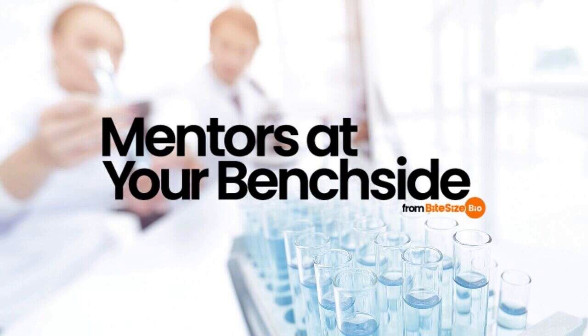The photomultiplier tube. These highly sensitive detectors collect photons emitted by your sample. They basically transform the light signal into an electrical one that's recorded by a computer. And in doing so, they multiply the current produced by the incident photons by several orders of magnitude, hence the name.